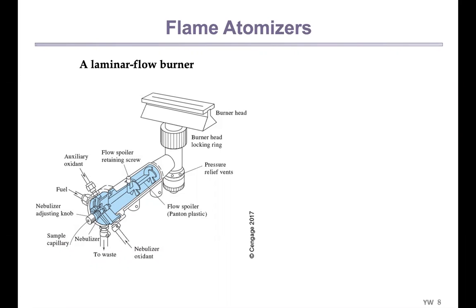So in most cases, the solvent won't interfere with your metal ions because they don't absorb the wavelengths of light there. In most cases, the interfering ions are those metal ions that can absorb at very similar wavelengths of light.